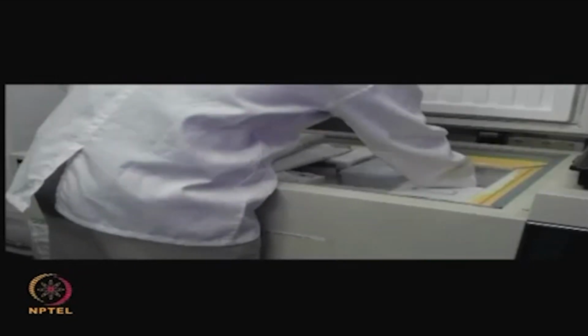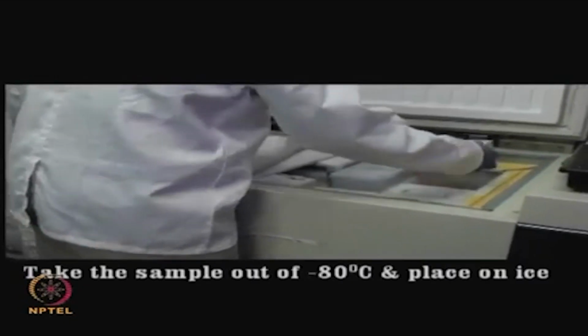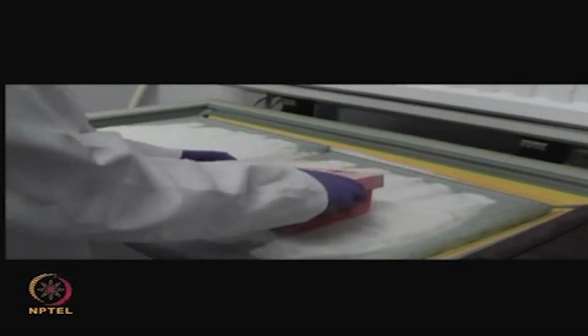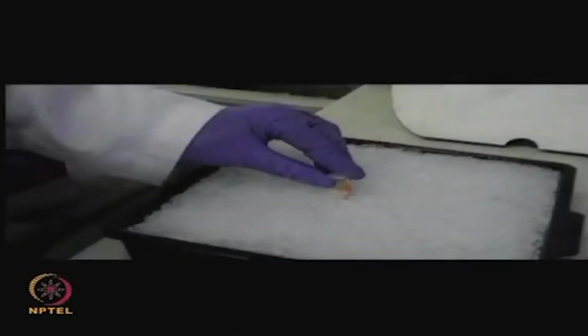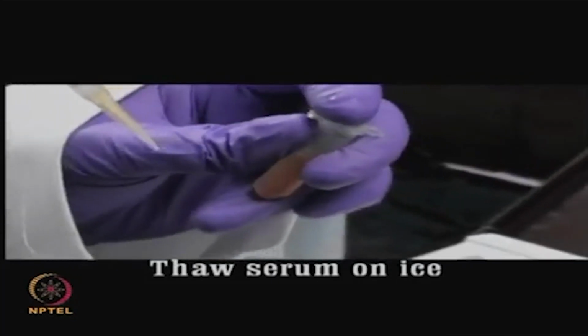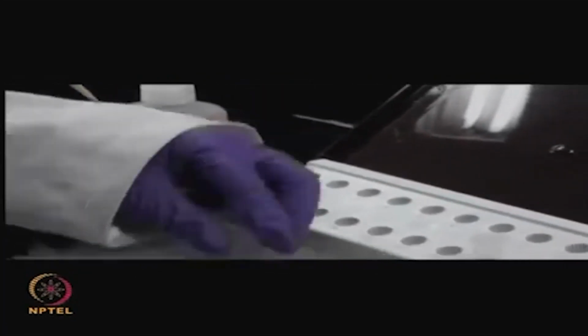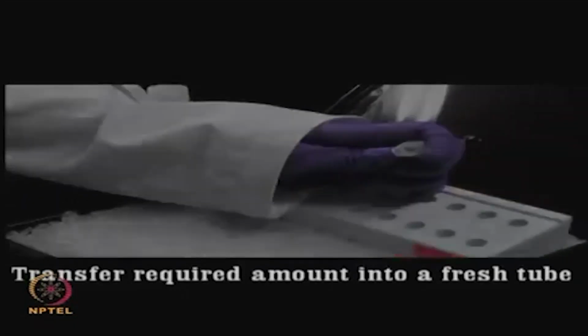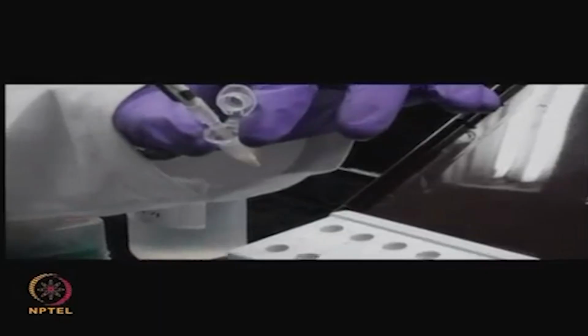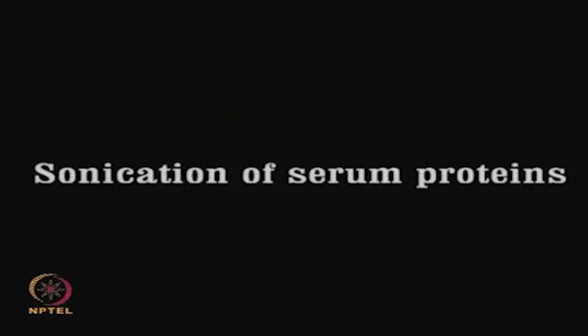Remove the serum sample from the freezer at least 15 minutes before performing the experiment. Place it on ice and allow it to thaw before use. Then, transfer the required amount of serum into a fresh, clean tube. Sonication.